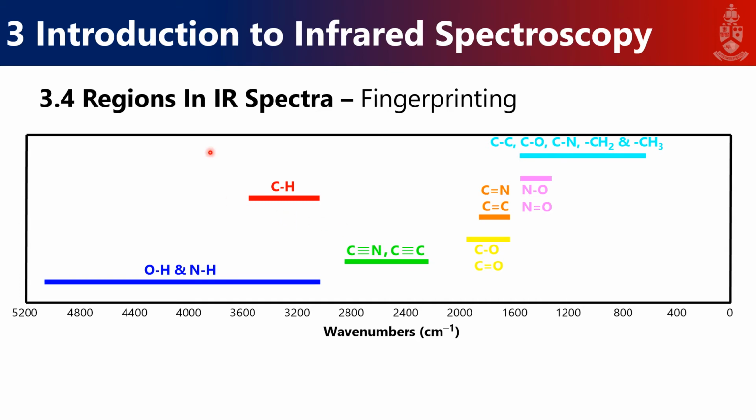So in other words, if we look at an IR spectrum and we see a stretch in this region, we can assign it to that moiety of the ligand, for example. So if we look at our complex and we see, oh, one of them has a peak there, then we know it's the one that contains a carbonyl, for example. Okay, so that's sort of how we'll use the IR.